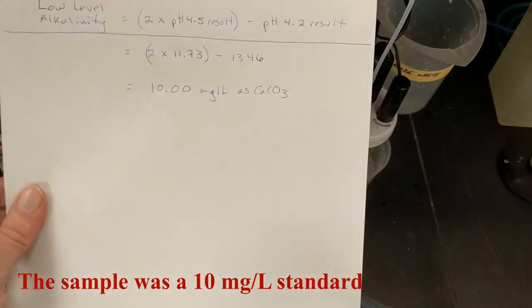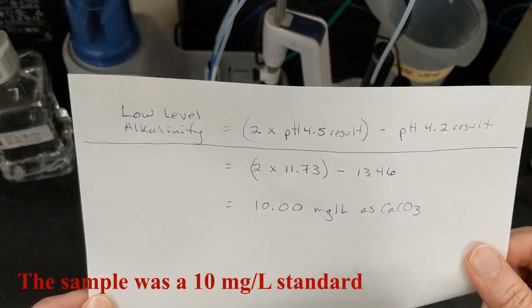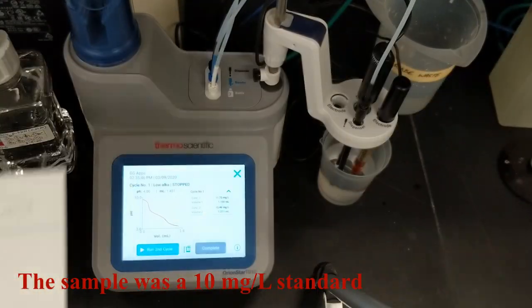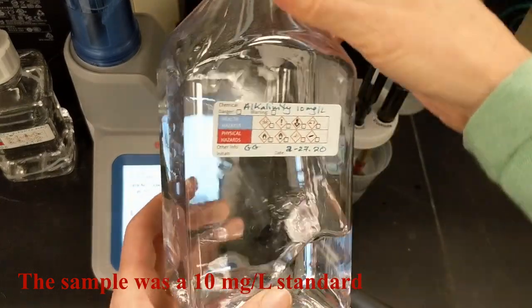This calculates as 10 mg per liter as calcium carbonate. Since the sample was 10 mg per liter alkalinity standard, my results are good.